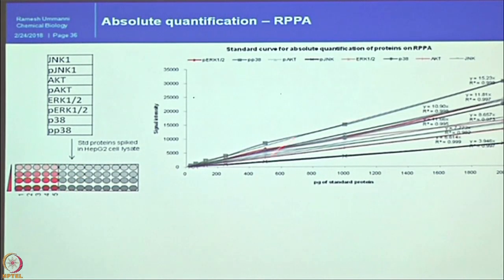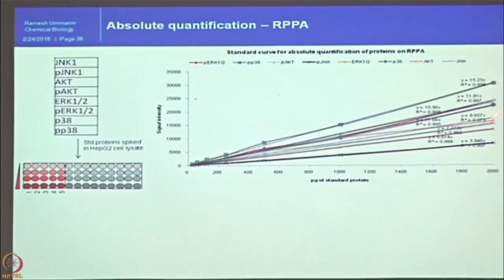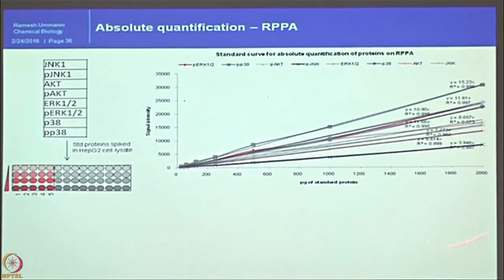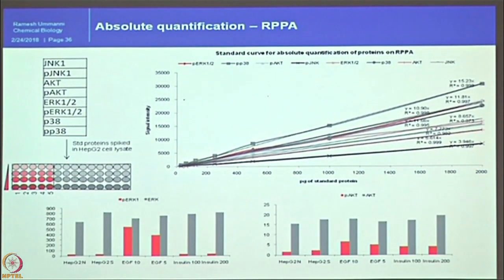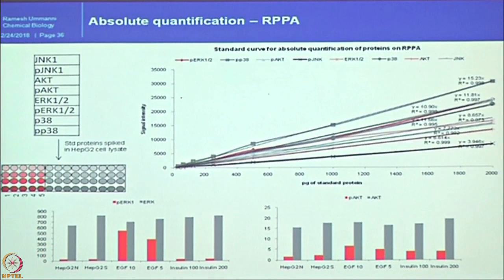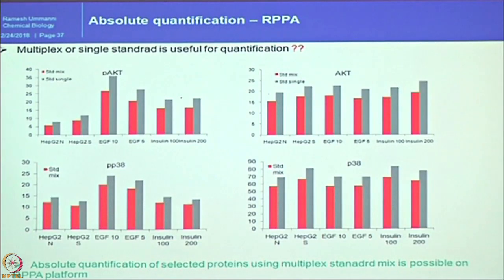We can show that for phosphorylated proteins and the unphosphorylated protein detection, the linearity range is above 0.9, and then we looked at the signals detected here, in different cell lines and different stimulated samples. We can nicely detect total values like this, and upregulated, downregulated copies are mentioned here. In a similar way for phospho-AKT and AKT here. The scales are different. Here it is times 10, here the total number is shown. So in this way, we can perform it.